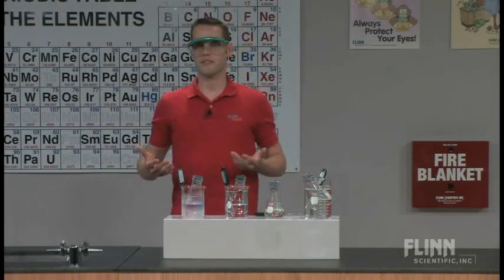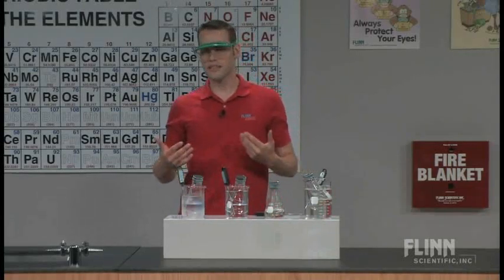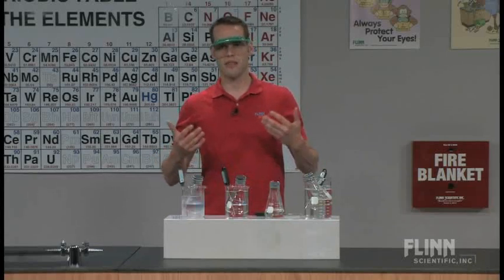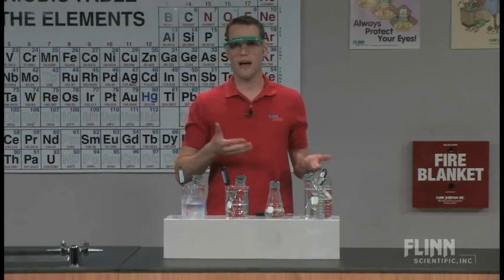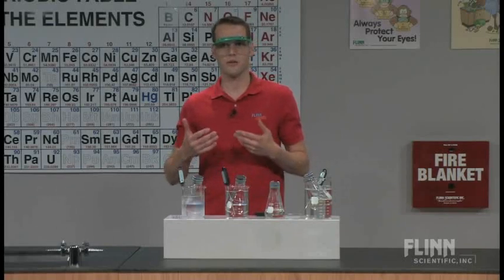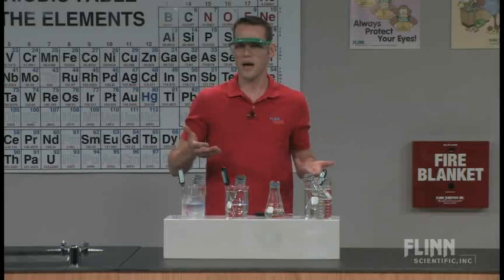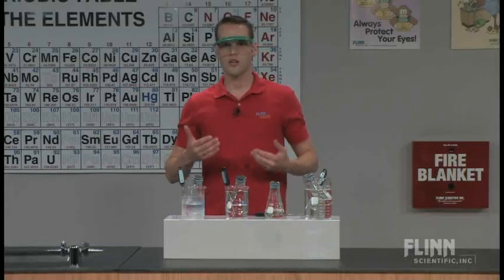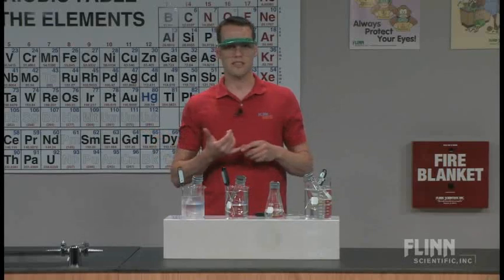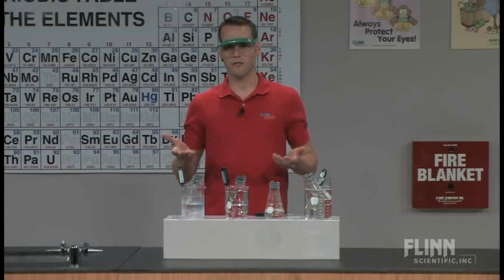This is well beyond the scope of a general chemistry class, but the rate at which a chemical reaction happens, I think, is something that's important and fundamental to any chemistry class. Students should understand the factors that cause reactions to go faster and slower, and in our everyday lives, this is one of the things that we do. If you're noticing something isn't going fast enough, students usually know that you heat it up to make it go faster. So a nice elementary reaction that you can use to demonstrate what's happening with effects of reagent concentration and with temperature is to use the blue bottle reaction.